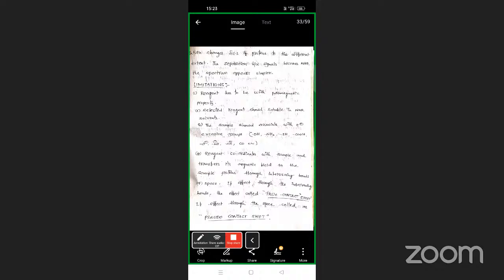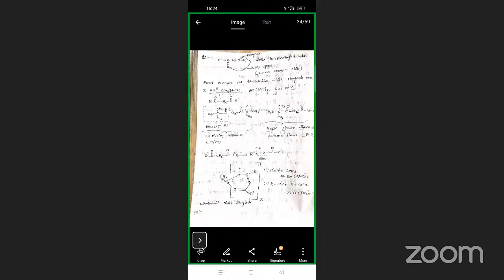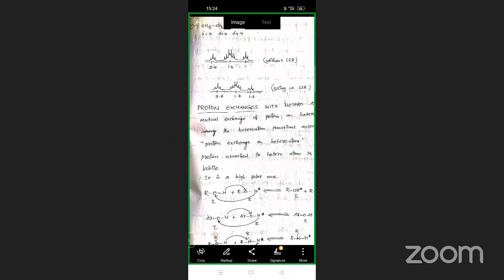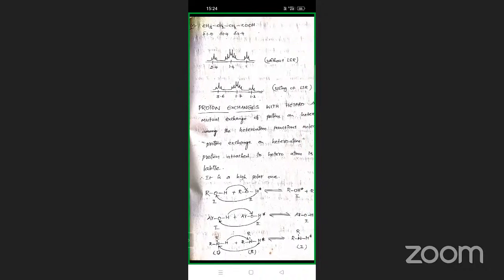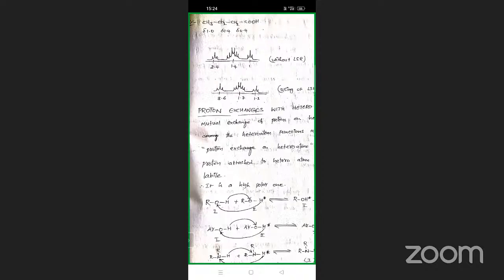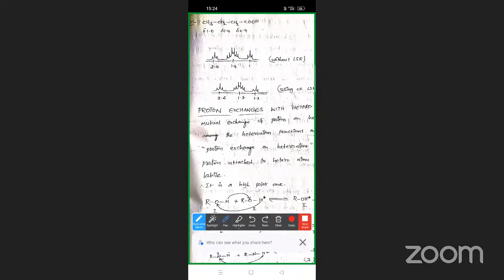So you can see, it is a compound where we have taken butanoic acid, whose delta values are given. So this proton, its delta is 2.4, and here is 1.4, and CH3 is 1.0. So these are the normal butanoic acid chemical shift values here.